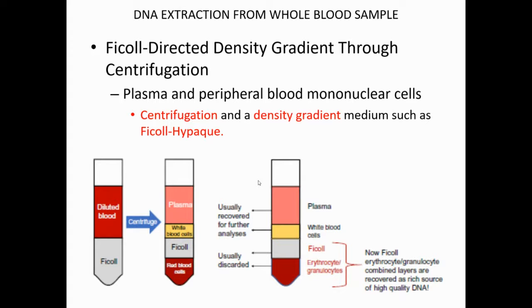As we know, the DNA obtained from the patient's whole blood sample is a key element for molecular diagnosis. The isolation of genomic DNA is the first step in running the molecular diagnostic assay. So it's essential to obtain highly purified genomic DNA from the sample. Whole blood is the sample we collect, and it can be routinely collected for plasma and peripheral blood mononuclear cell isolation, using centrifugation and a density gradient medium to separate the different cells.